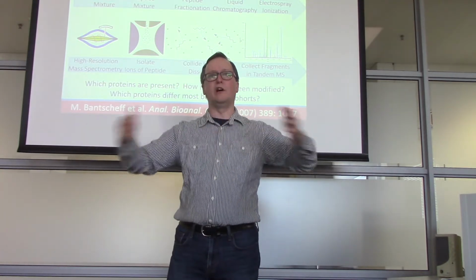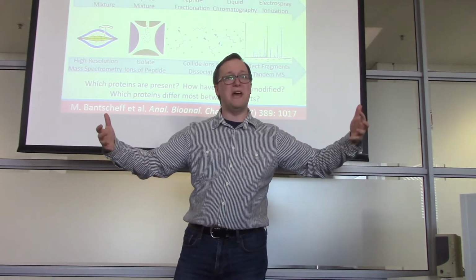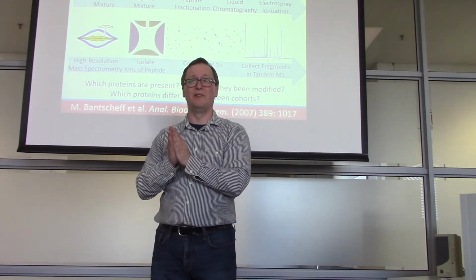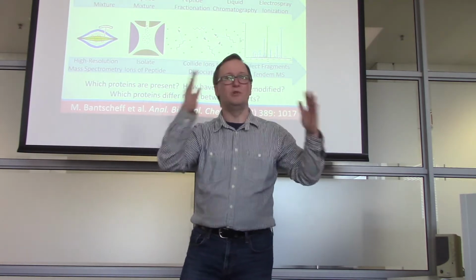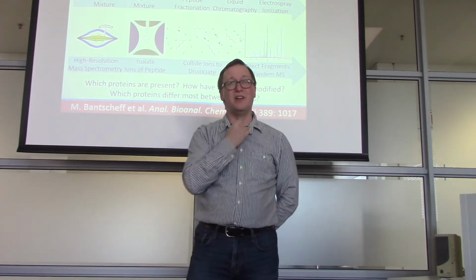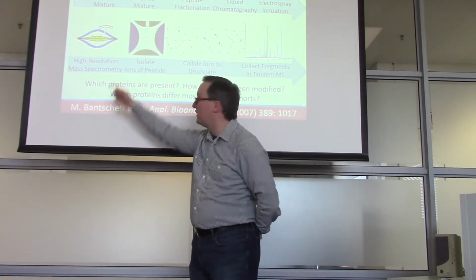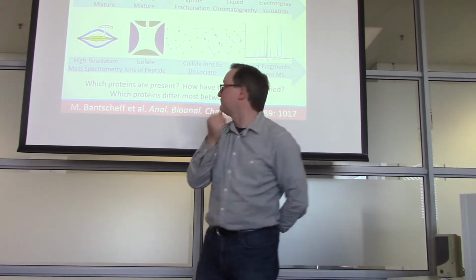Okay, so the longer a peptide it is and the types of side chains that it contains will increase its mass, but the more protons it carries, the more that mass will be divided to get you down to a lower m over z value. So a larger mass may be carrying more protons. So there are these 2 countervailing effects. All right, so in high-resolution mass spectrometry, we're going to measure the mass to charge values of these peptides very, very precisely. Here I've drawn an Orbitrap for this measurement, but it could be, say, a time of flight measurement as well.